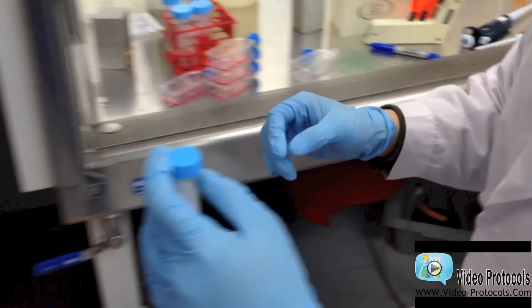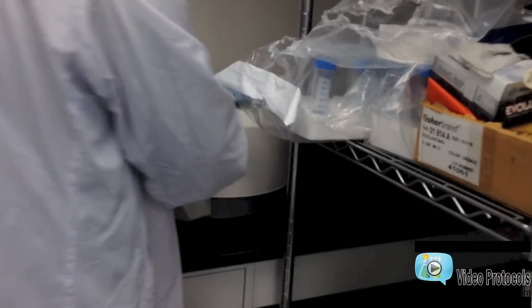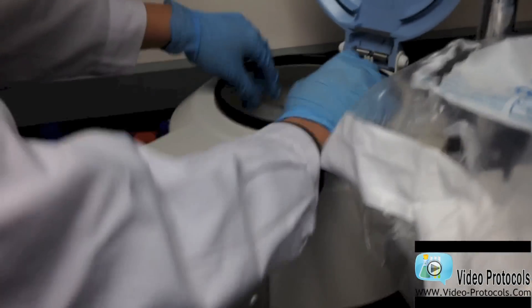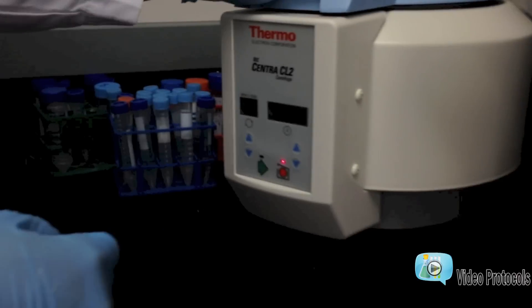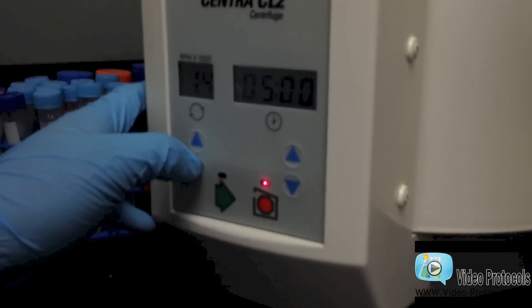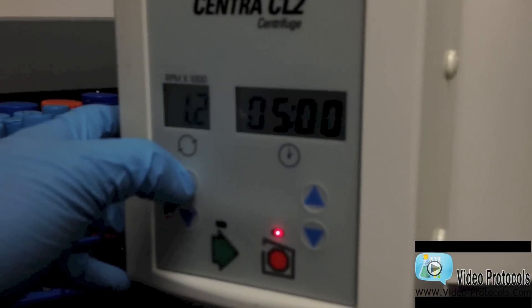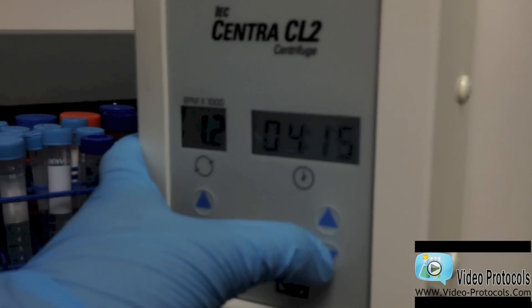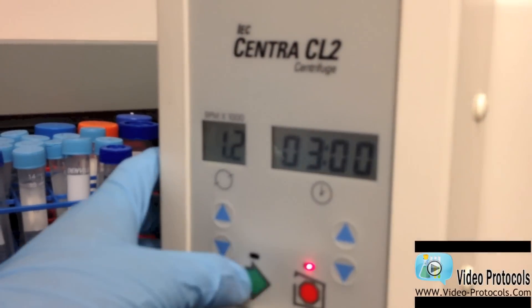I will spin down or centrifuge the tube to get a cell pellet. This is 400 g for 3 minutes.